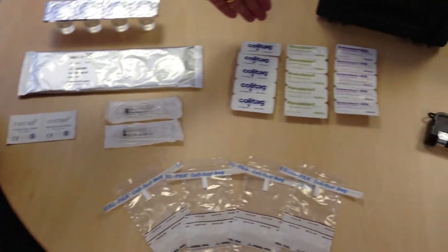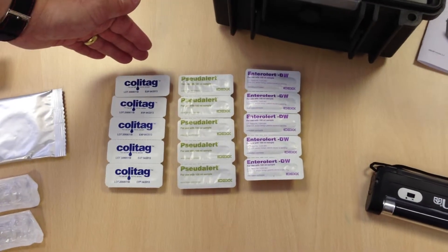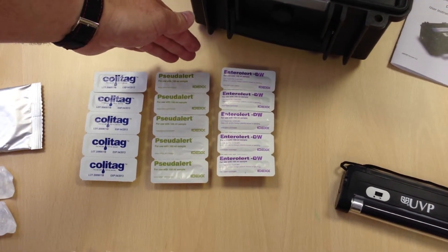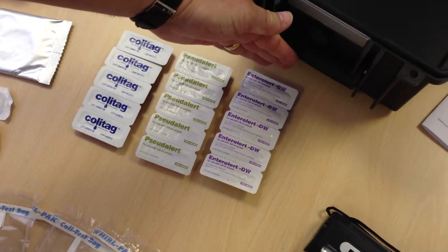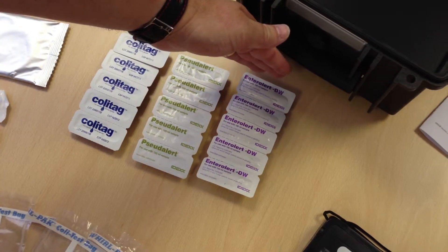For coliforms and E. coli testing, it uses the ColiTag powder capsules. For Pseudomonas aeruginosa, it uses the PseudoAlert powder capsules. For Enterococci testing, it uses the EnteroAlert powder capsules.